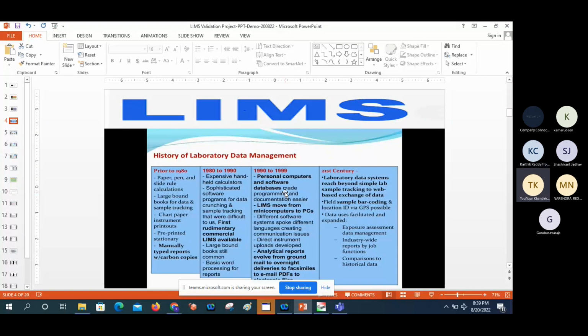Yes, sir. Myself, Tawfiq. I am in quality control right now, and we are handling Caliber LIMS over here as an analyst. So you are performing as an analyst in a laboratory using LIMS. Have you ever been involved in master data creation? No, I'm working as an analyst and a reviewer. So you are the end user, performing the analysis in the quality control laboratory, right? Yes, correct. Okay, no problem.